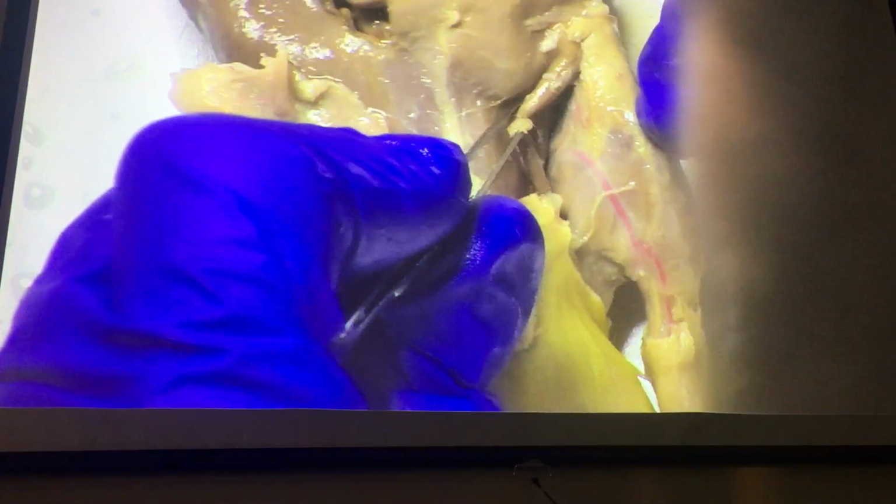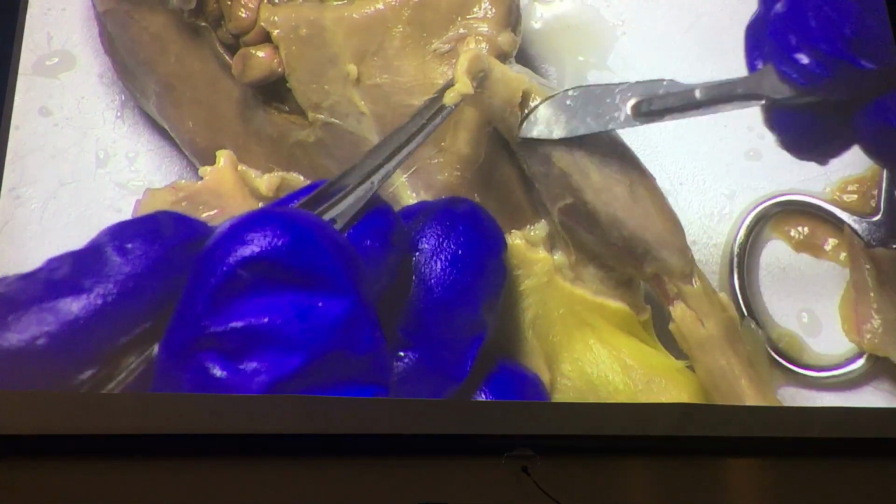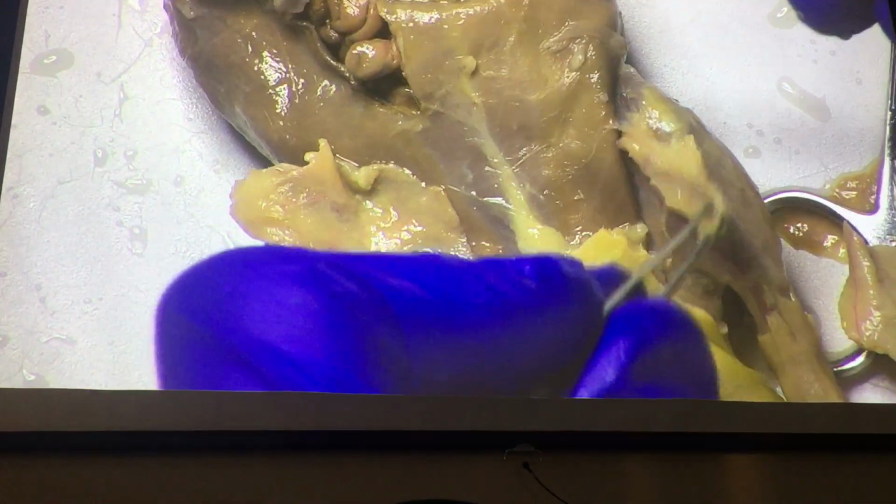But now you've got a little bit more of the inner thigh. We still have some fat here. We left a little bit of chunk on this guy. And the love handles. But there she is. Nice big chunk of fat there to get rid of.